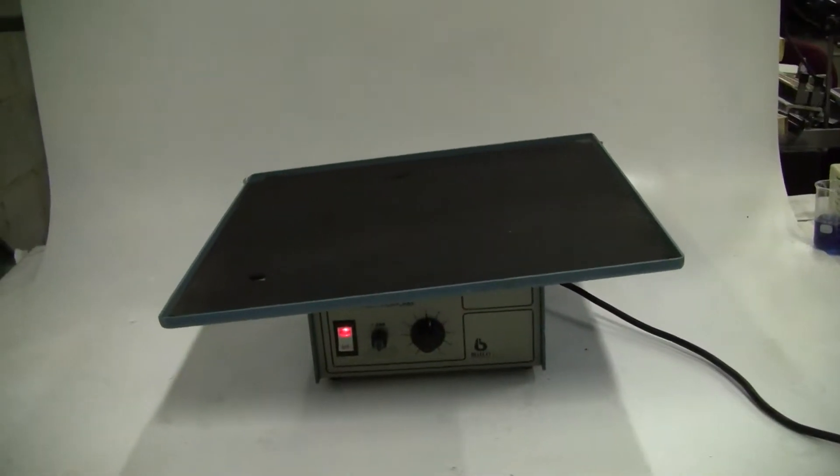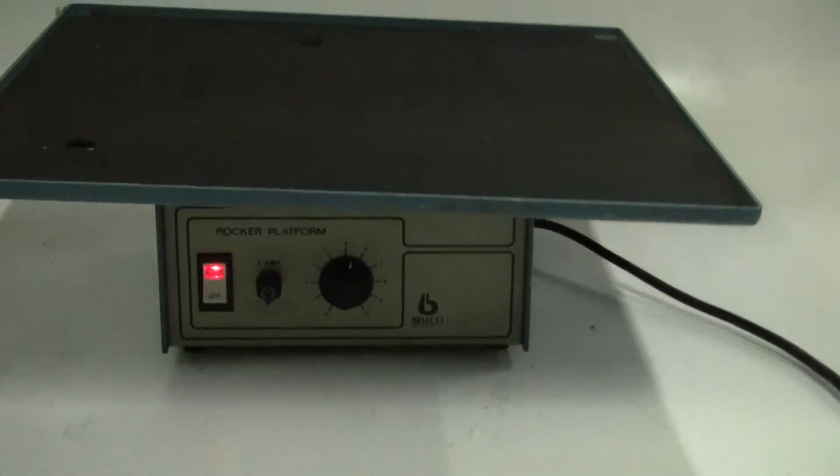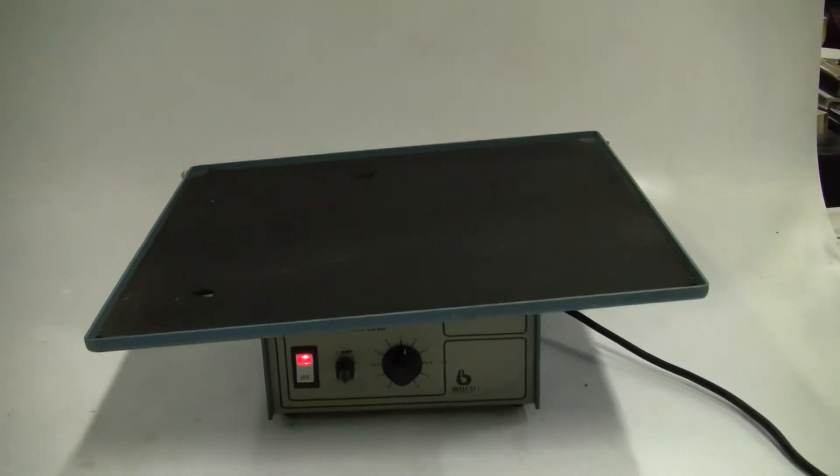Hi, this is Michael from High Tech Trader. Today we are looking at a Bellco rocker. It's a variable speed rocker. Shelf dimensions are 20 by 20.